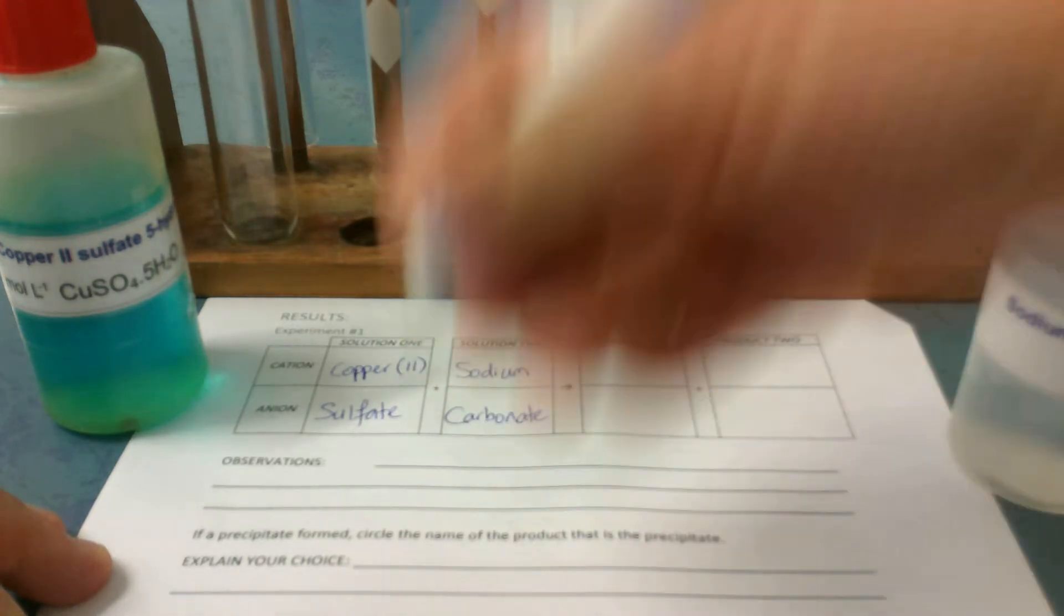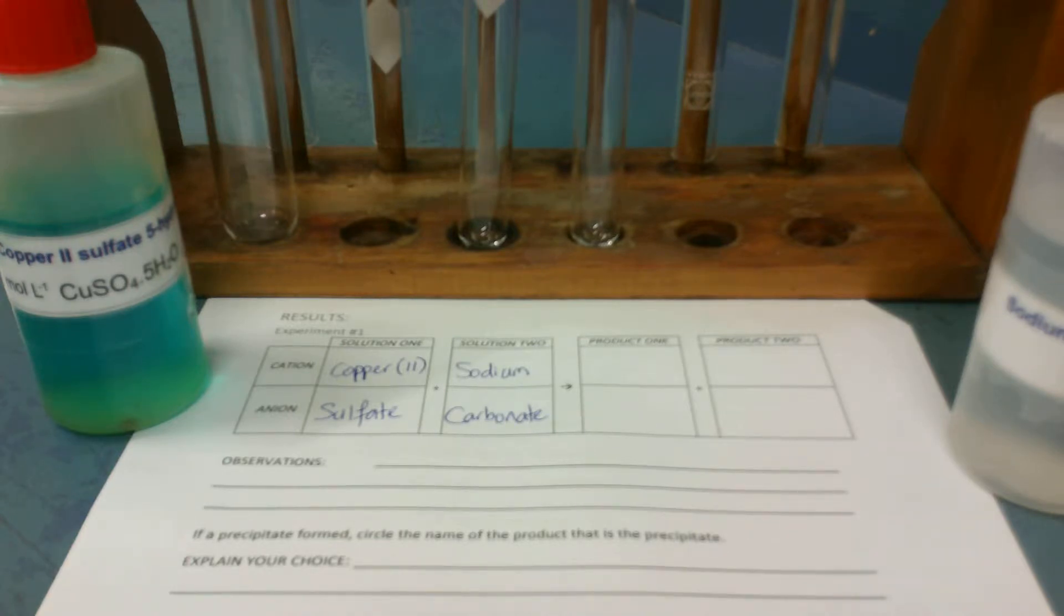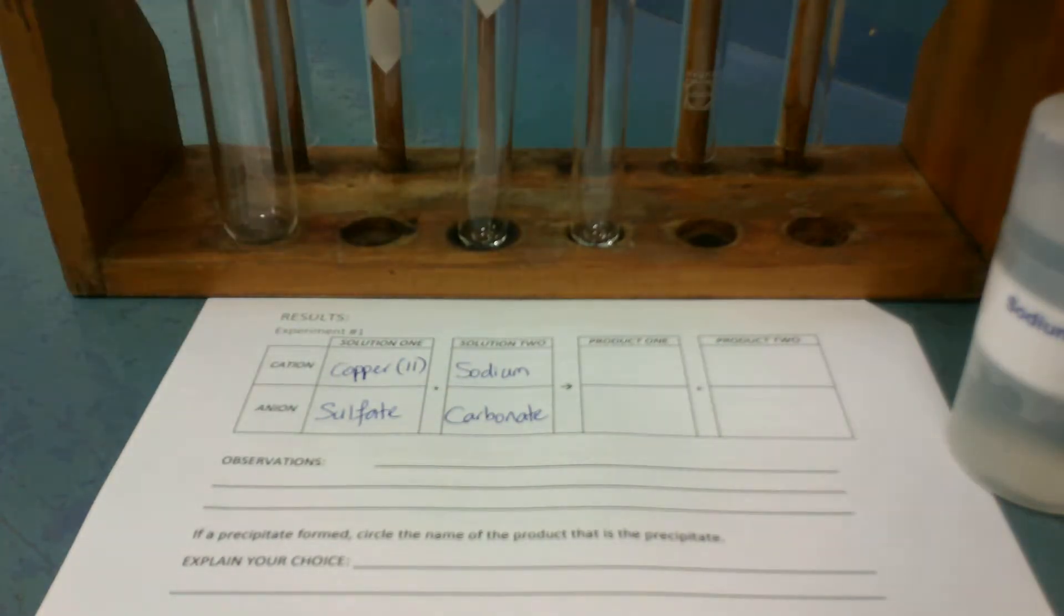Now the trick is to mix them together. So what we're going to do is we can choose either one. The easiest way is solution 1 goes into the test tube. So I'm going to pour a little bit of solution 1 into the test tube, just a little bit. So you can see it's not much up on the screen. It's just a little bit at the bottom.